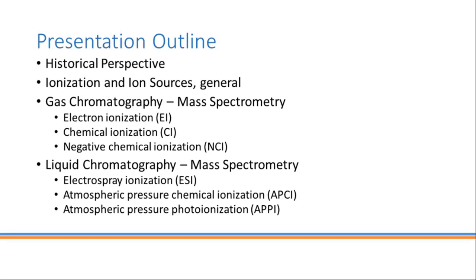I'll give you first a little bit of a historical perspective and talk about a little bit of general aspects of ionization and ion sources, and then we'll get into the meat of the presentation with the various different ways that you can create ions for GCMS and LCMS.